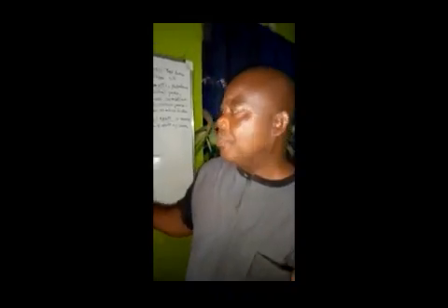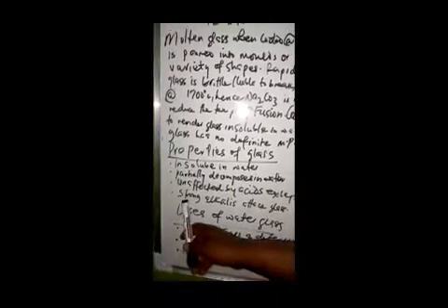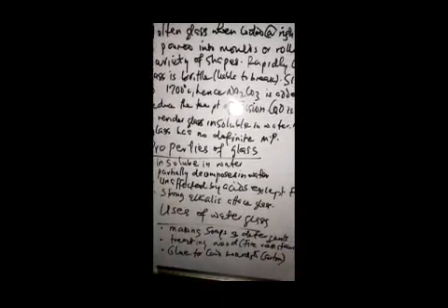What are the common properties of glass? What are those properties with which you know a glass? It's insoluble in water. Yes, as we have said. It's partially decomposed in water. Like if somebody gives you a broken glass, some part of the glass can be dissolved in the water, and that says it partially decomposes in water. It's unaffected by acids. The only acid that affects glass is hydrofluoric acid. Glass is attacked by strong alkalis like sodium hydroxide, potassium hydroxide, calcium hydroxide.